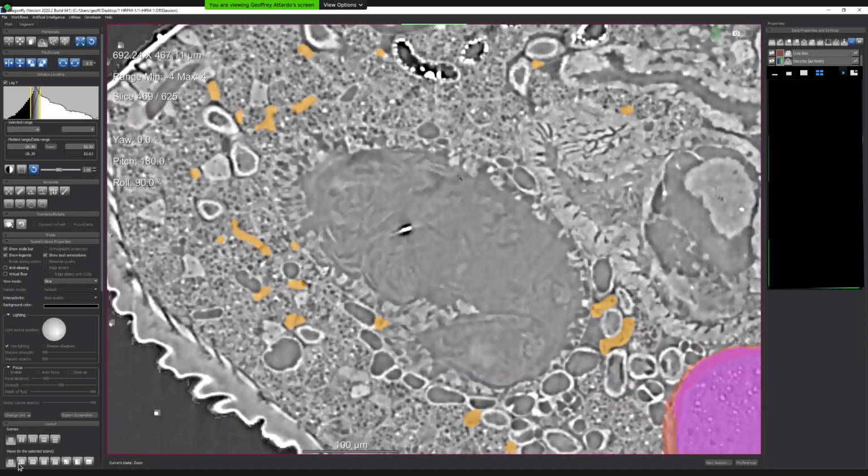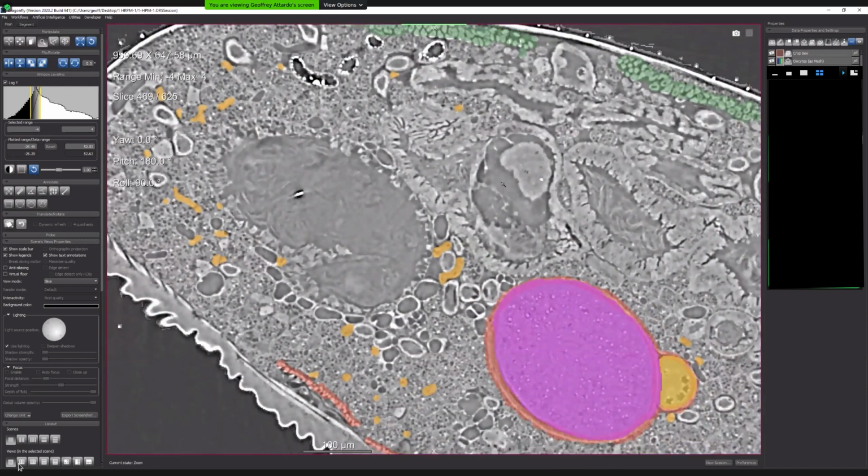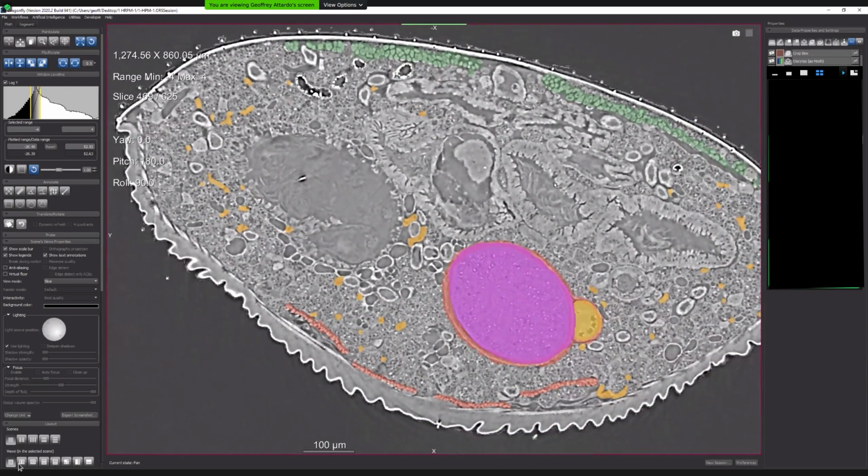I originally wanted to use this volume, but I couldn't. I was able to pull out the individual slices, but I was not able to pull the associated ROIs with those slices. I wasn't able to figure out how to do that. So I ended up pulling a set of 5 slices. I painted the oenocytes, and then I used those.